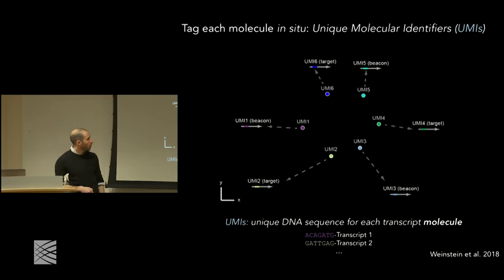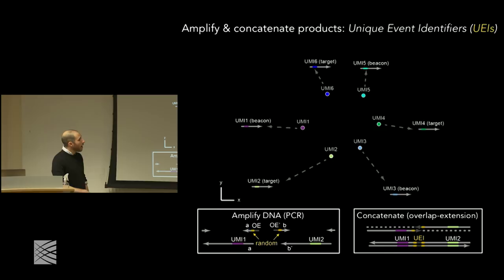So, all right, we've started out with this sample where every single molecule gets its own DNA sequence. And again, this is entirely bipipetting, so there's no specialized equipment involved because we're just randomly tagging every single molecule with a random DNA sequence. And now what we're going to do is start amplifying the sample using PCR, just the means by which one normally goes about amplifying DNA. And at every single cycle within the PCR process, the number of copies of DNA roughly doubles. And for those of you who are not familiar, PCR happens using these little primers, these little fragments of DNA that anneal to different parts of the DNA sequence and allow for synthesis of different strands of DNA in different directions. And that allows for this amplification process to take place.